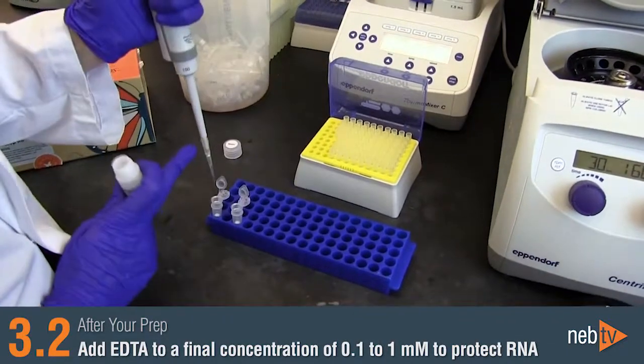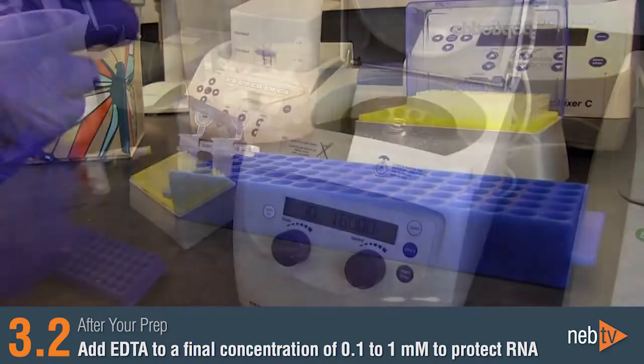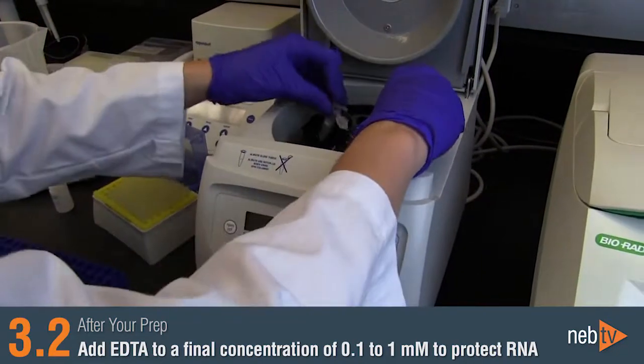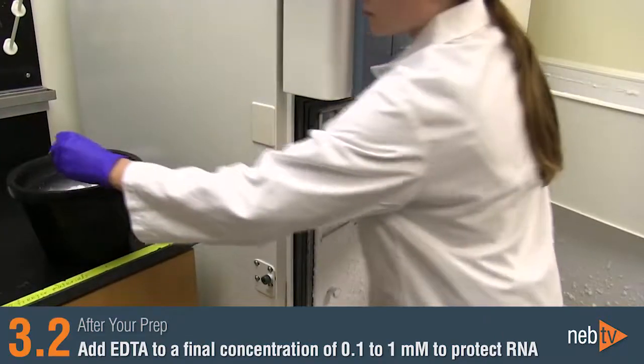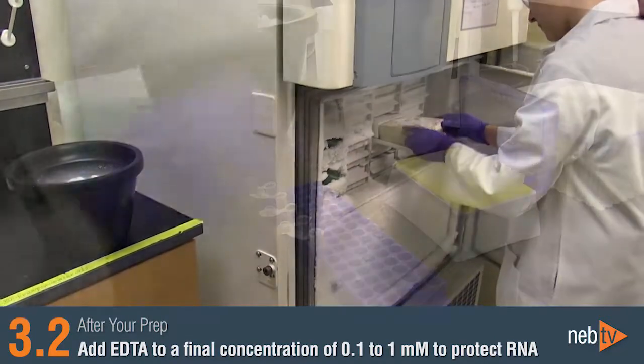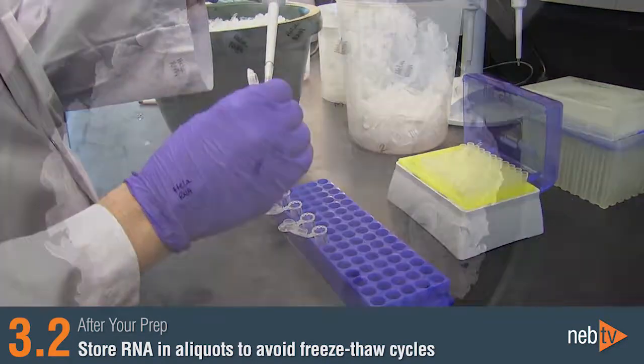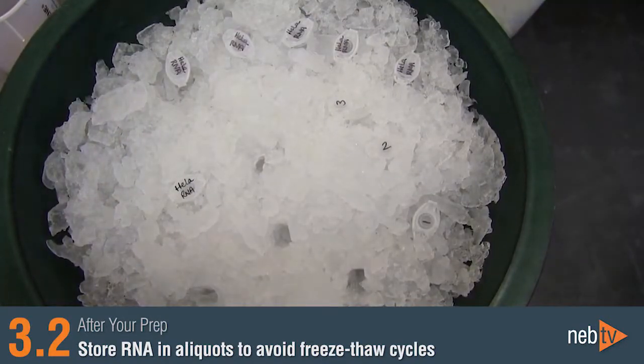While nuclease-free water is provided in this kit for the elution of RNA, adding EDTA to a final concentration of 0.1 to 1 millimolar can protect RNA samples that will be stored for an extended period of time. Additionally, it's good practice to store the eluted RNA in aliquots to avoid excessive freeze-thaw cycles.